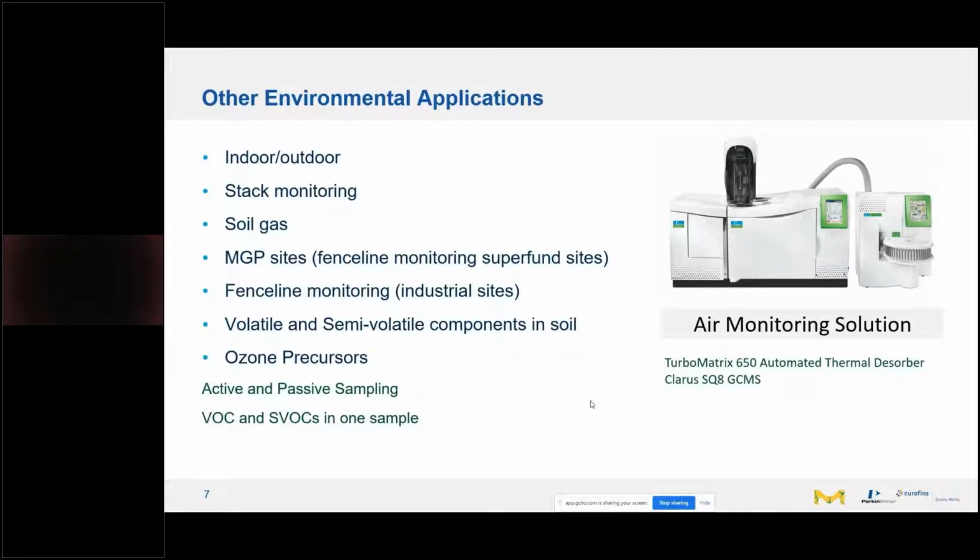It uses thermal desorption. What's nice about thermal desorption is we're able to do volatile and semi-volatile components in one sampling procedure, so the boiling point target range goes from C2 and recovers up to C44.